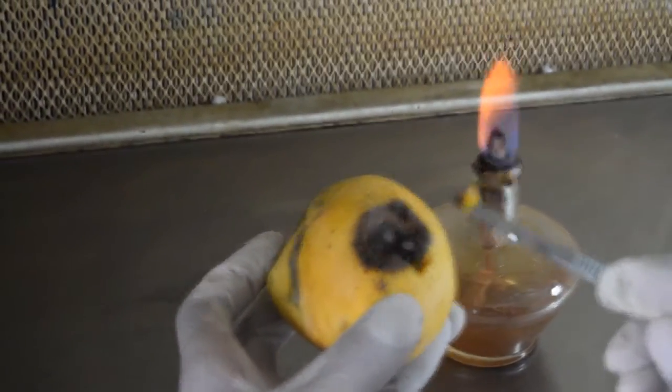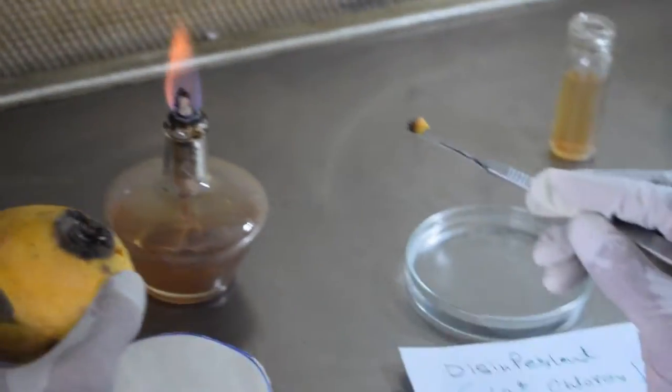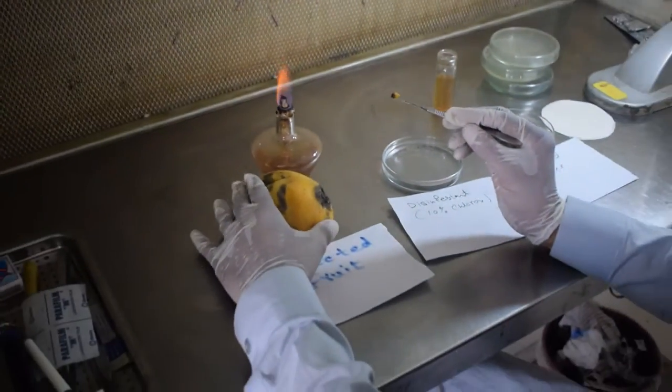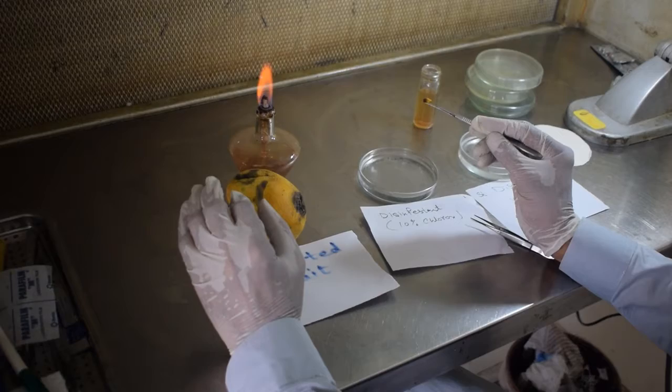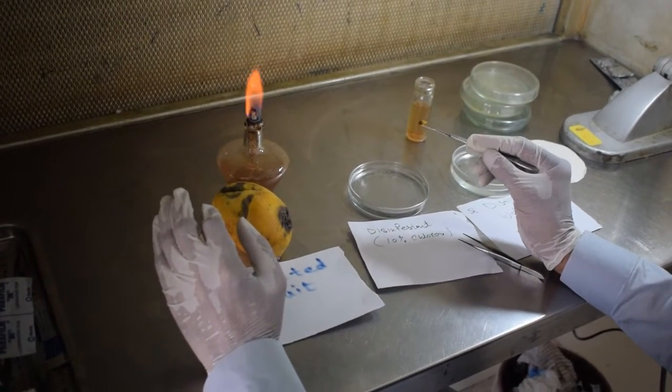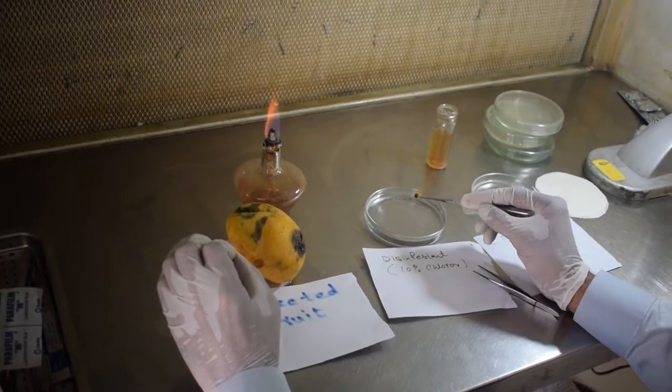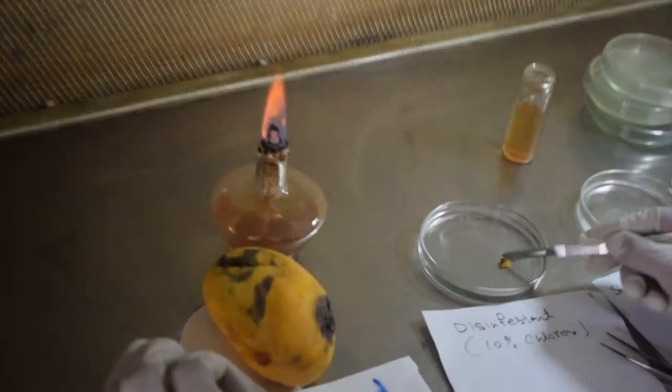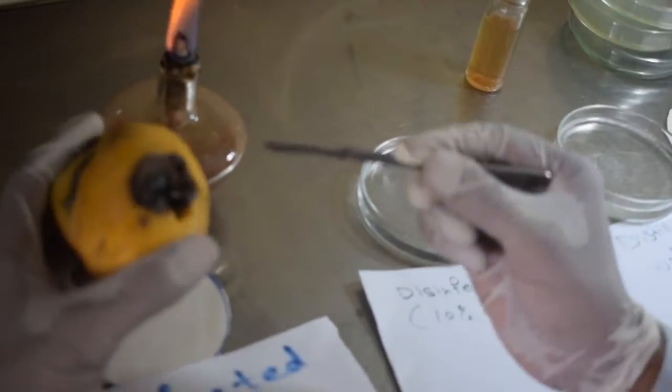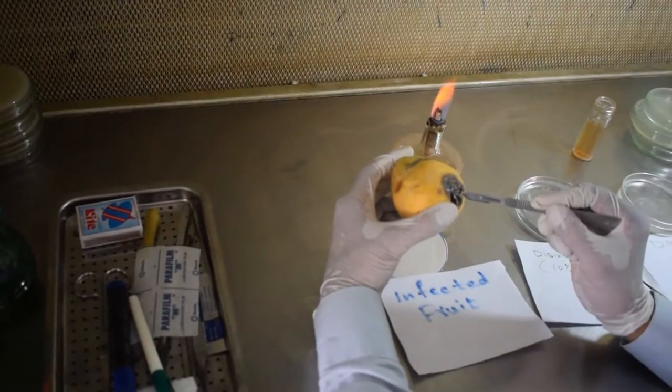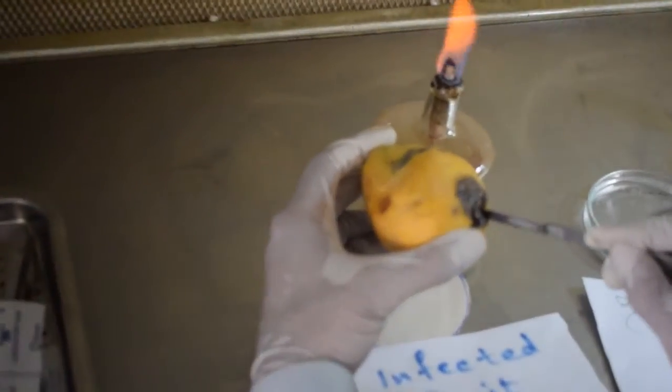We need the infected part and the living part, and we are taking 3 pieces for 3 petri dishes.